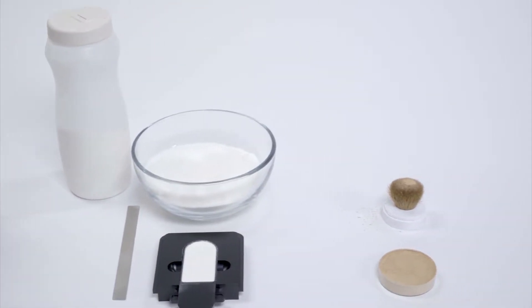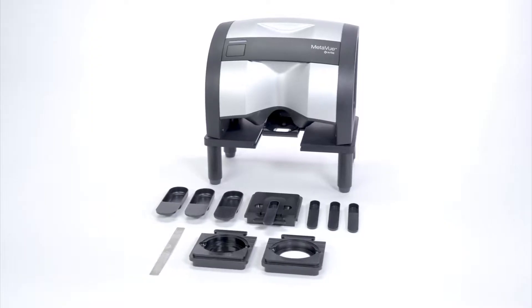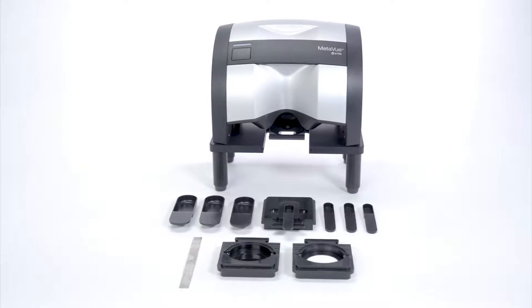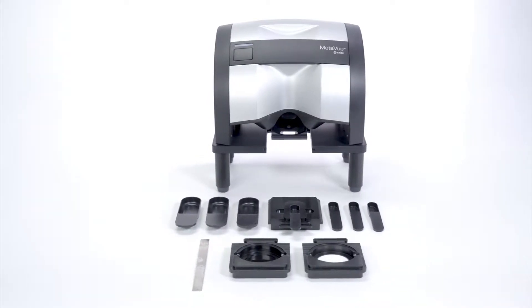All the sample holders used with the BS450 instrument stand are fully compatible with the MetaView instrument stand. They can be used with spoons or petri dishes, and custom sample holders can be provided.